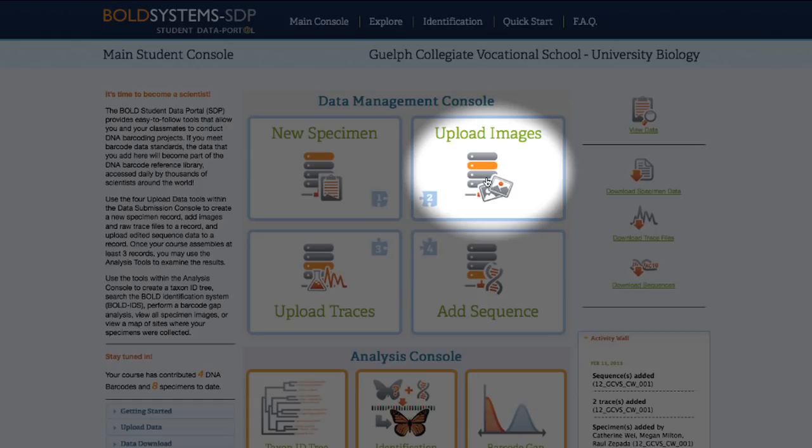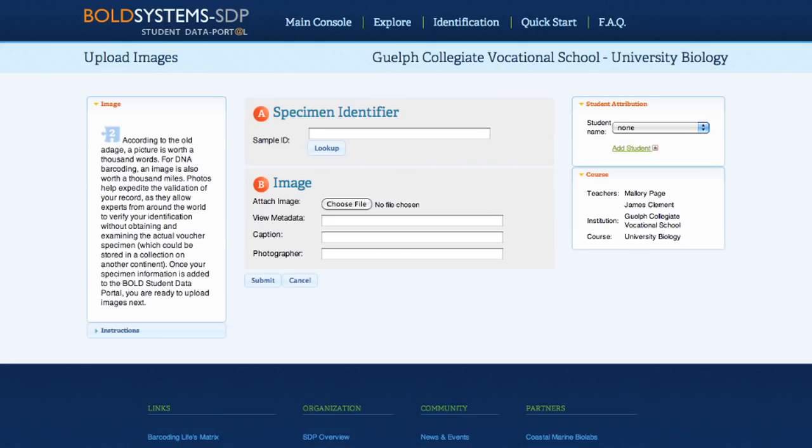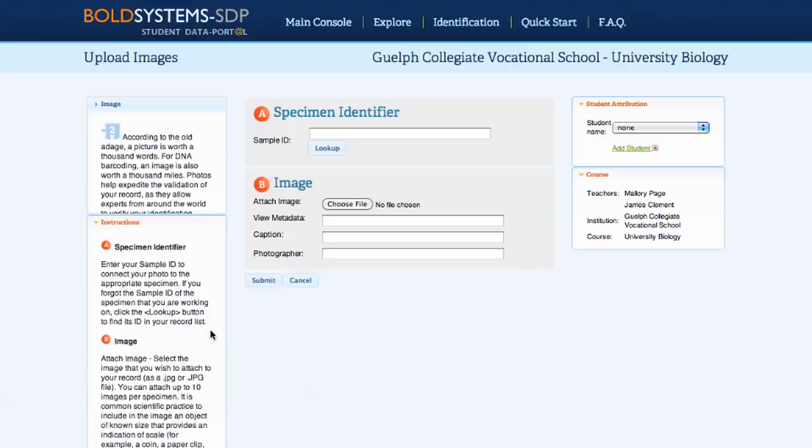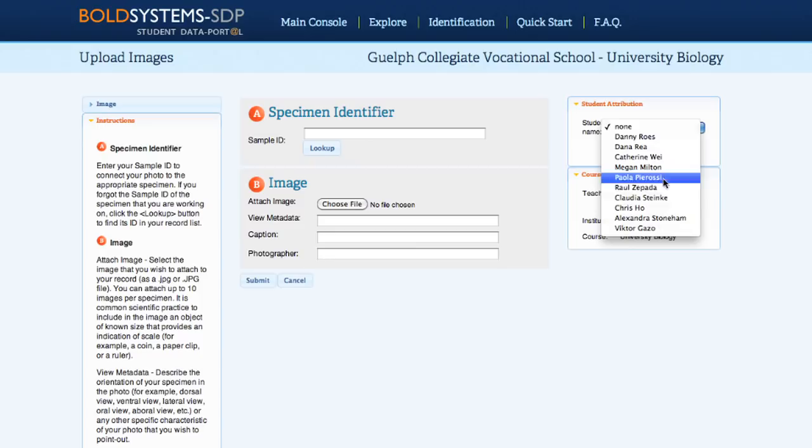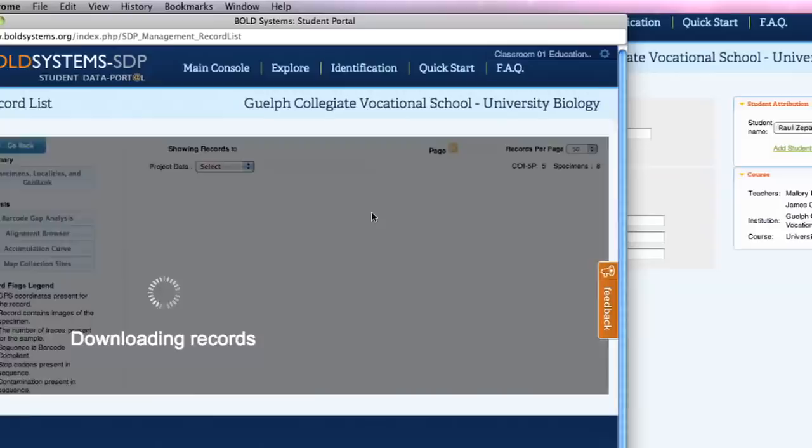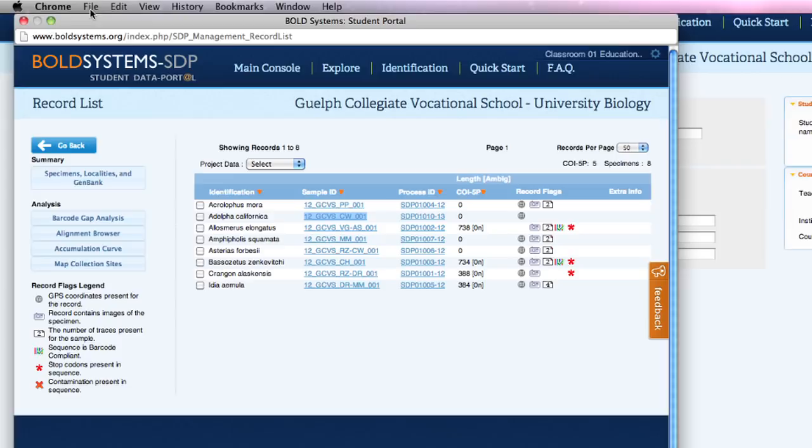Once the specimen data has been uploaded, head back to the main student console and select Upload Images. Instructions are listed on the left-hand side of the page, and student attribution is listed in the top right. The sample ID lookup tool displays all of the records that have already been uploaded to a course, allowing students to easily find the sample ID they're looking for.